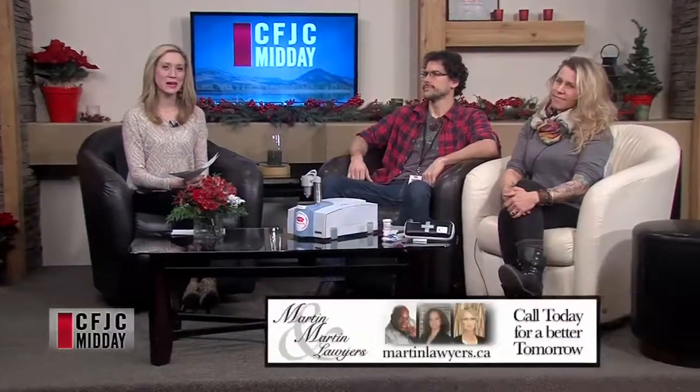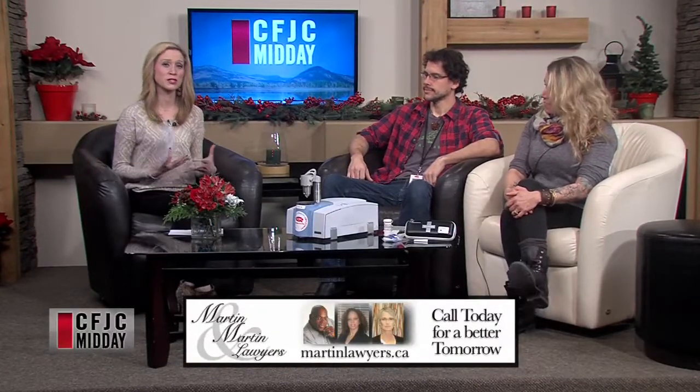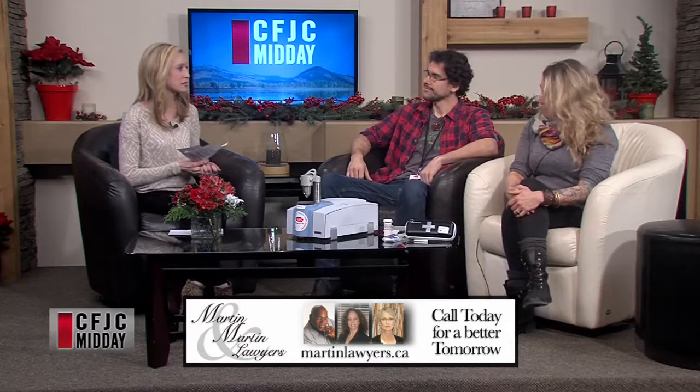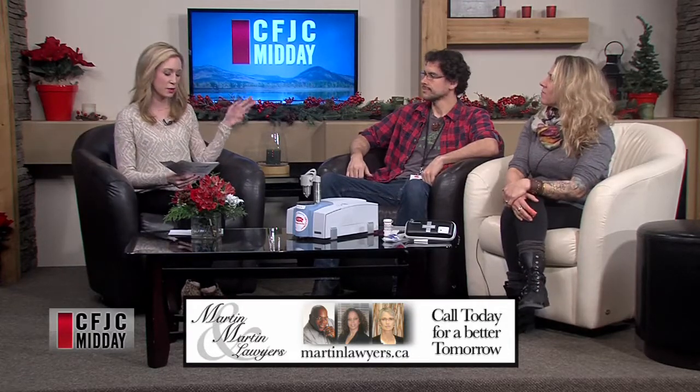Back to Midday. We are talking about, well, actually, this is a prevention segment, a drug prevention segment, I guess we could call this. We have Tira Hogue from Ask Wellness joining us, and we also have Kyle McKenna, who is the operator for the machine we're talking about today, the FTIR machine. So thank you both for being here.